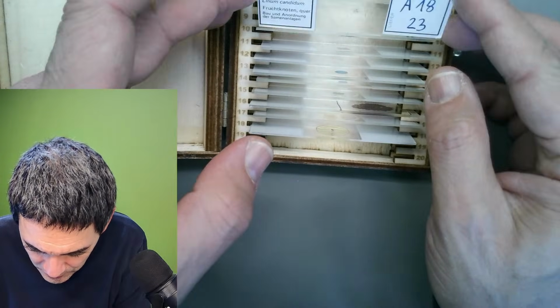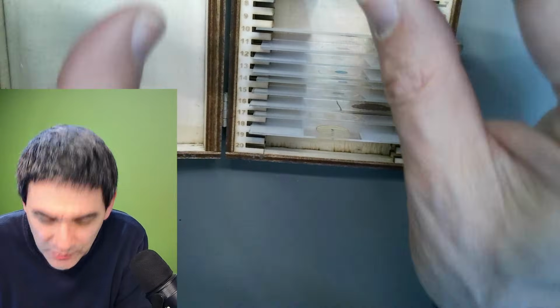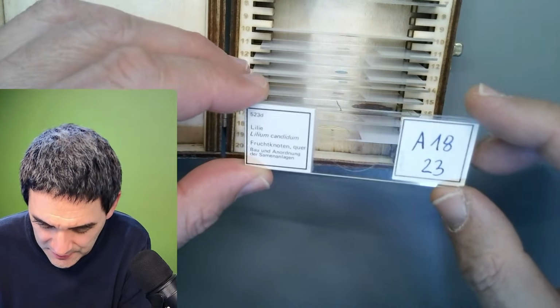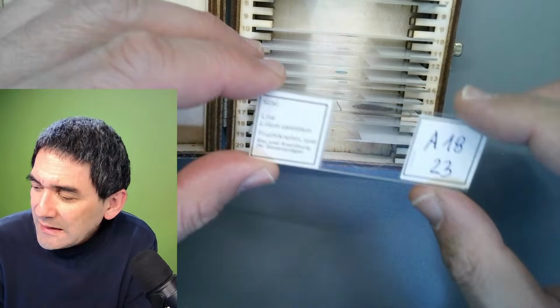So let's go on here a little bit. There are a few others. I think that's one of the things that I wanted to show you. That's the ovary of a lily, of a plant, and this is quite cool. Let me show you.